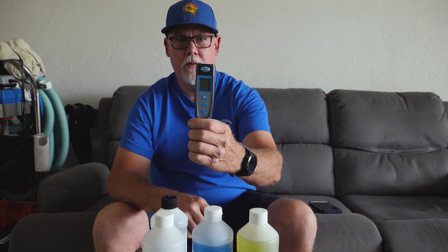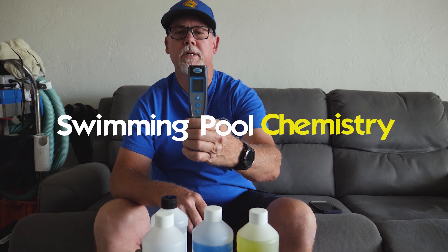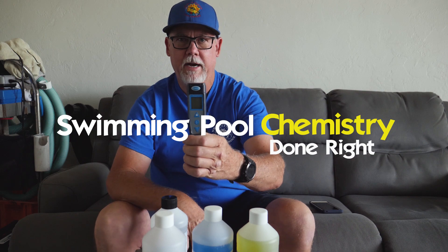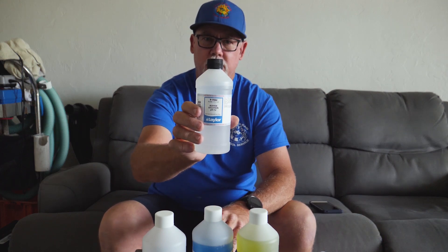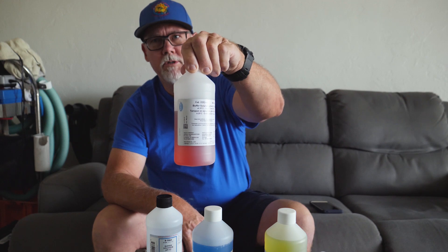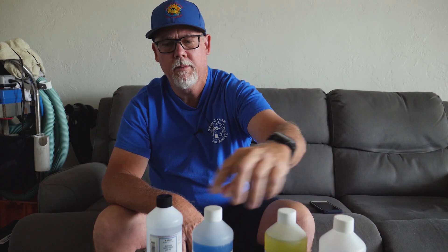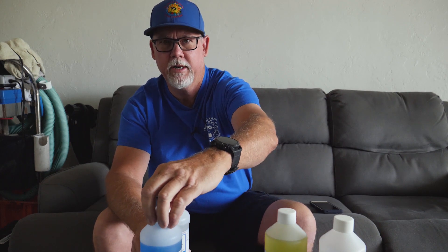Hey guys, today I'm going to do a video on the Hawk Meter. This is the one that I use and this is the one that I recommend, and we're going to find out just how accurate this meter is today. We're going to be testing it against the Taylor 7.2 solution, 7.0 solution, 4.0 solution, and 10.0 solution, just to see how accurate it is.